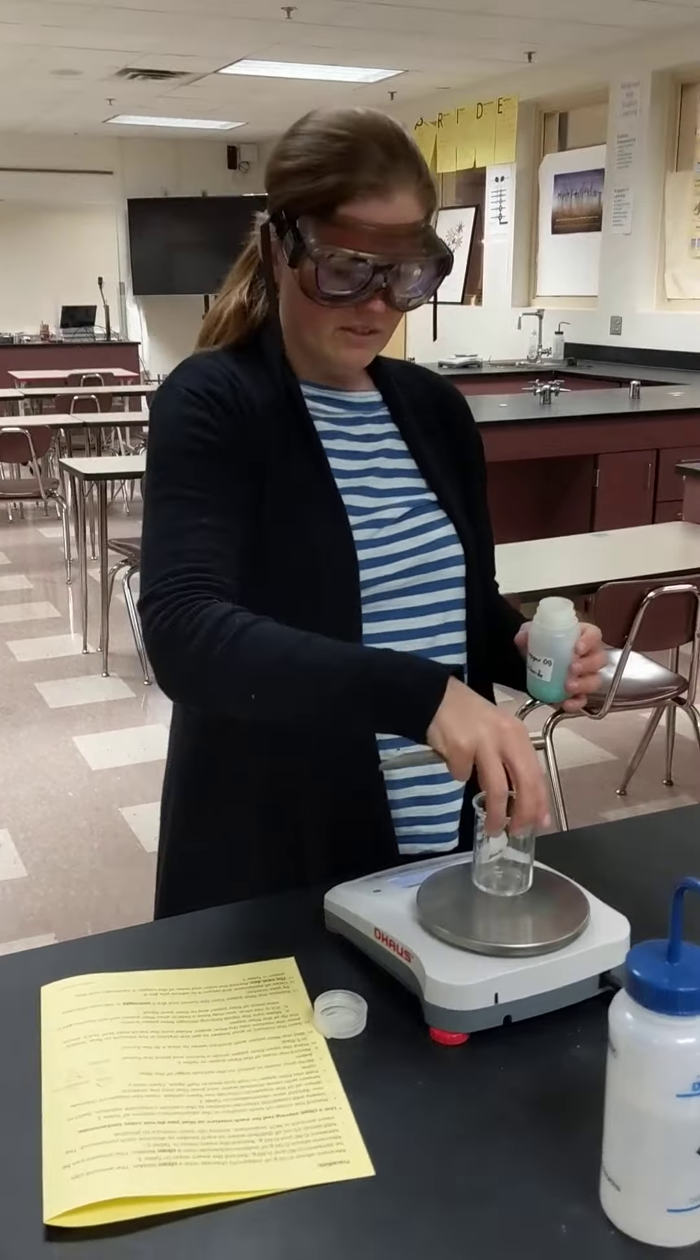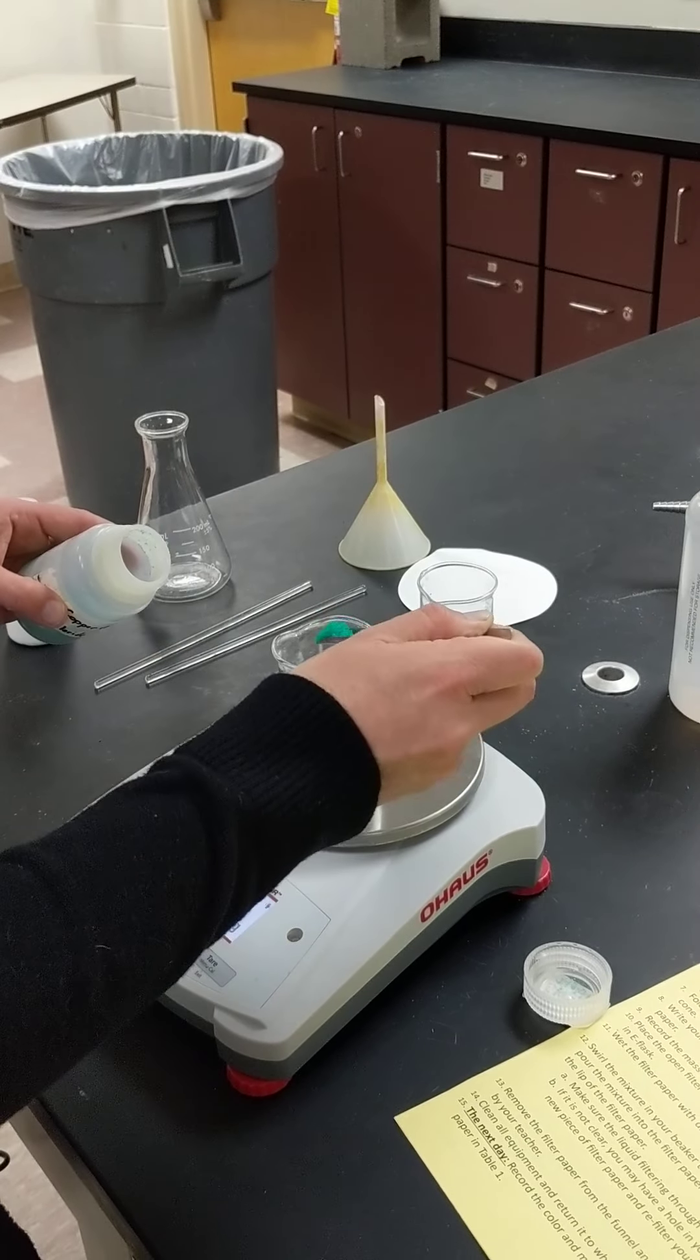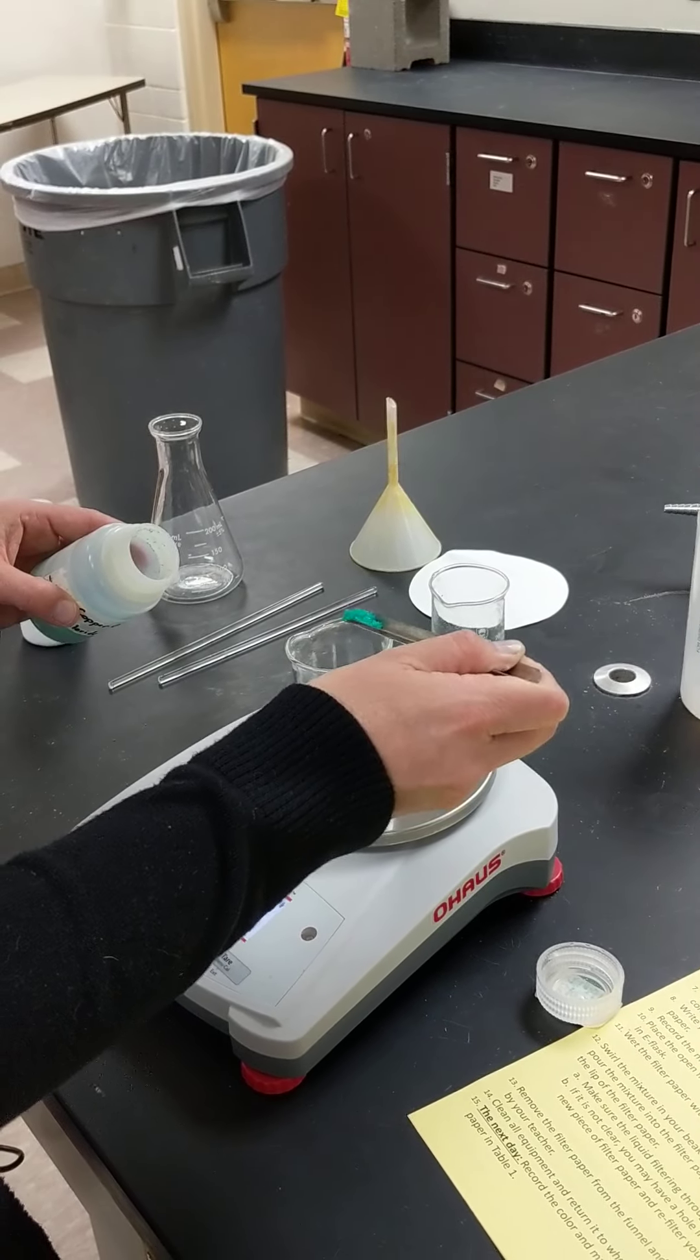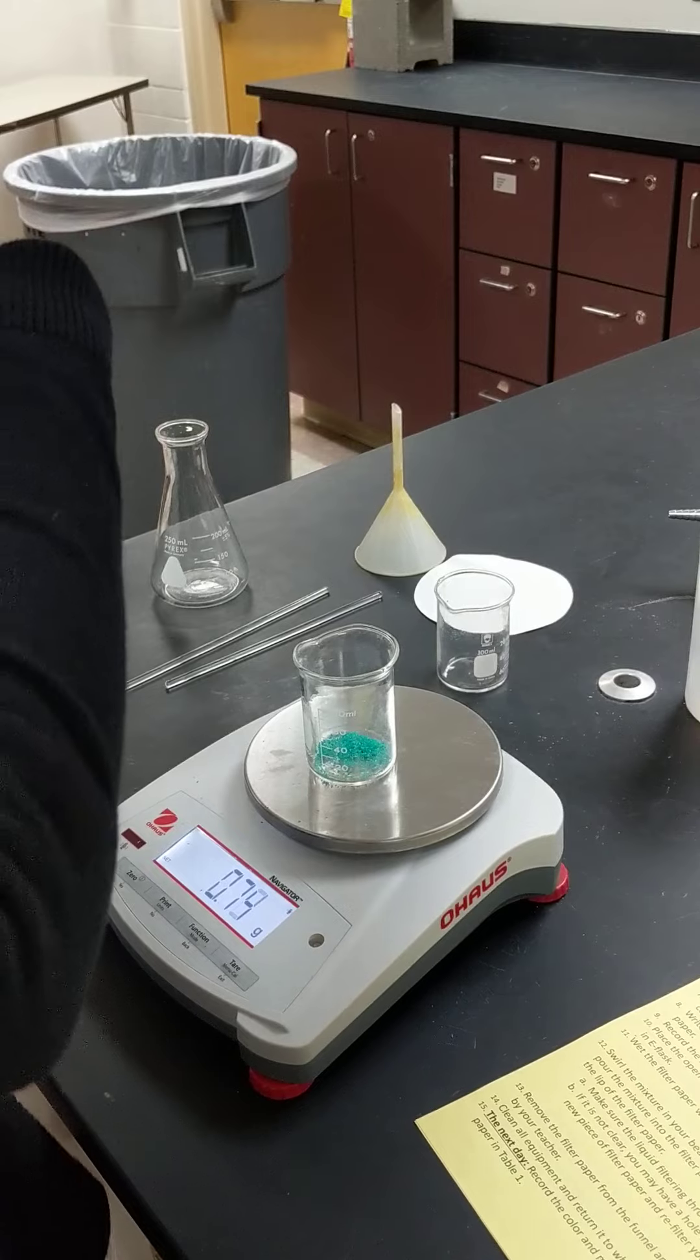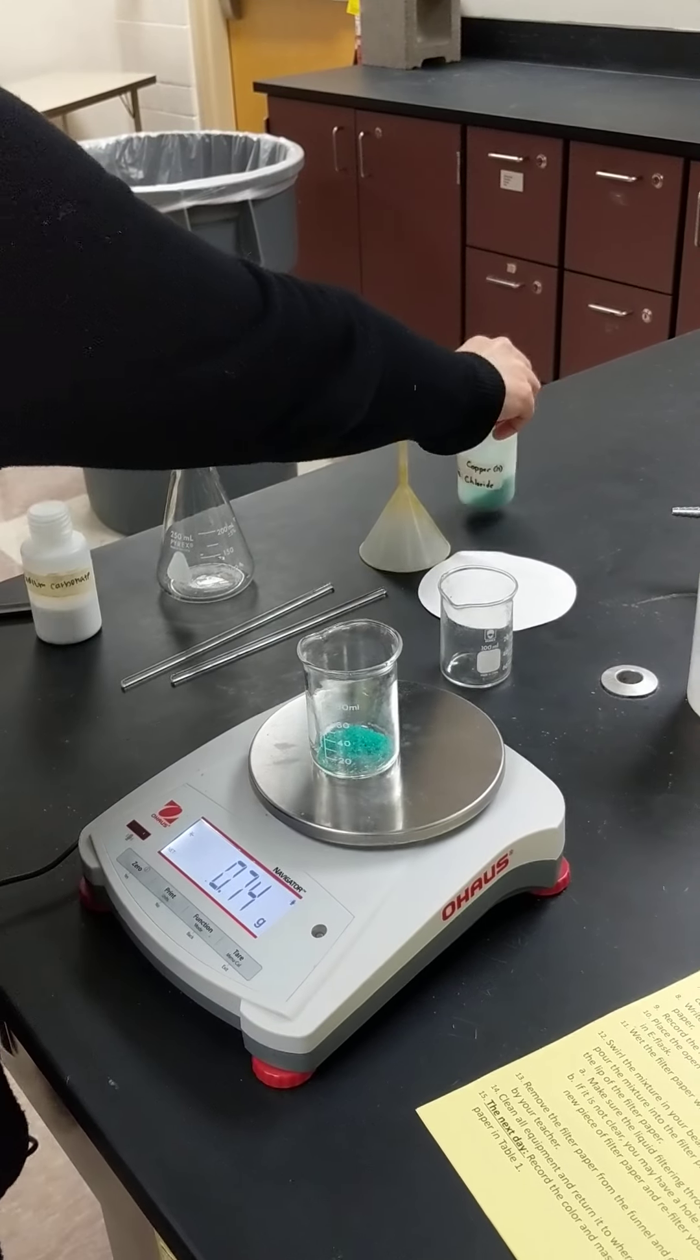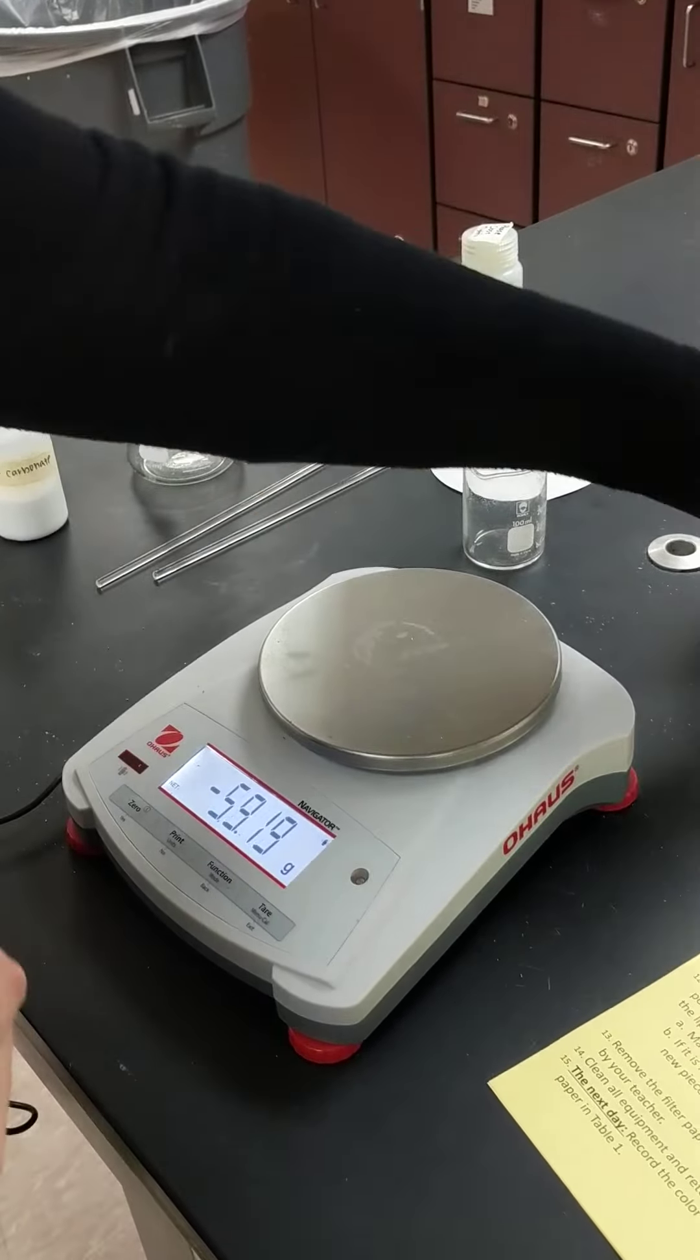So we're going to zero out the beaker. We're going to tare the beaker and then we're going to get 0.5... 0.75. We won't put back, that's fine. It doesn't really matter what we start with. 0.75.